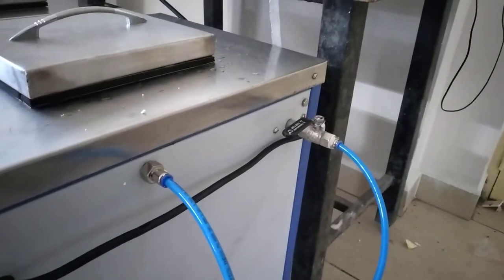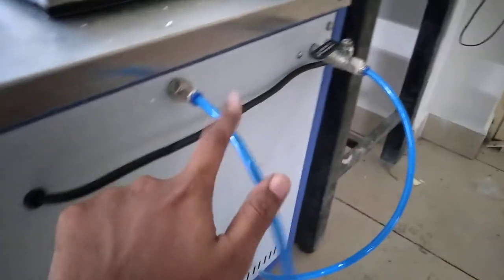This is the pump outlet. This is the inlet.